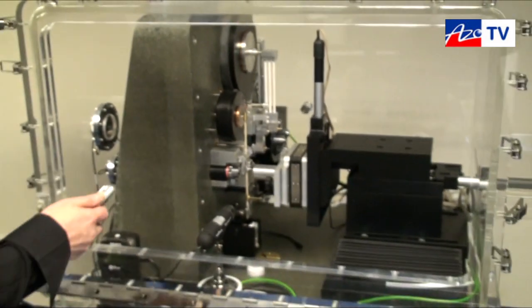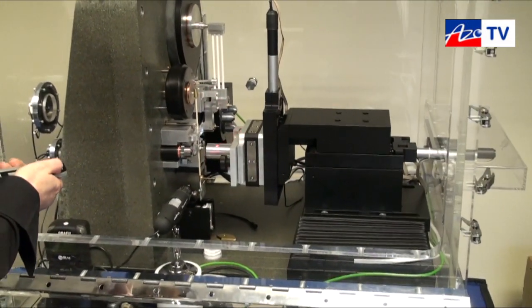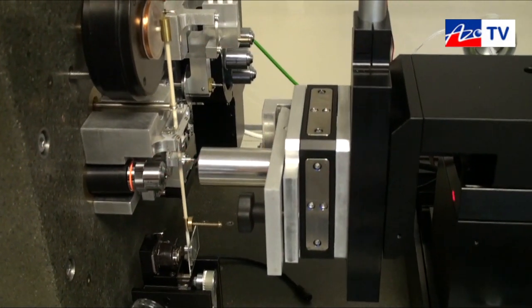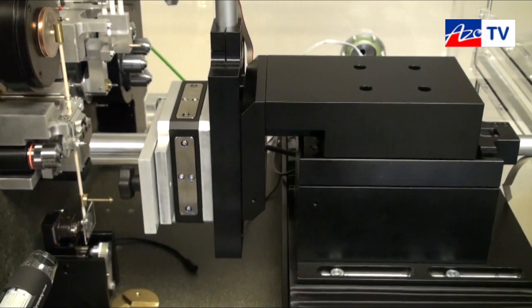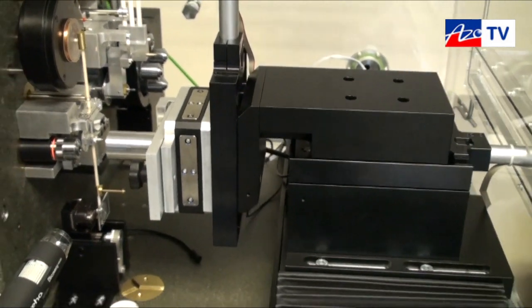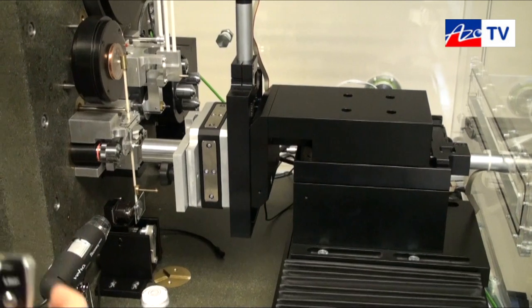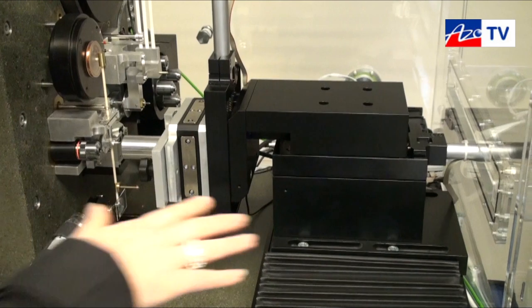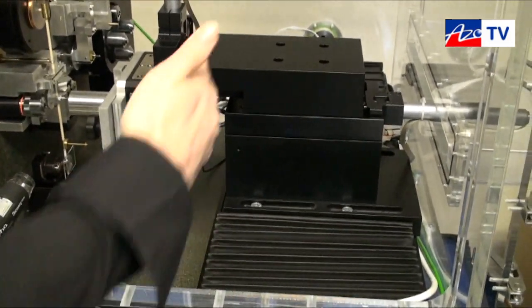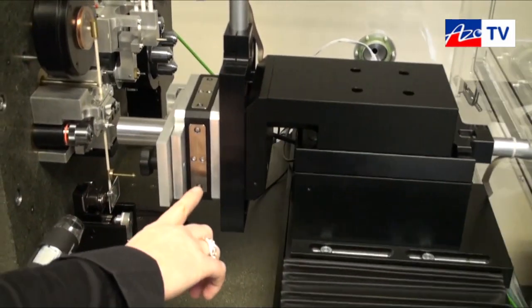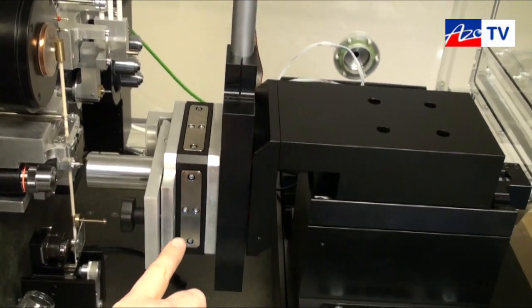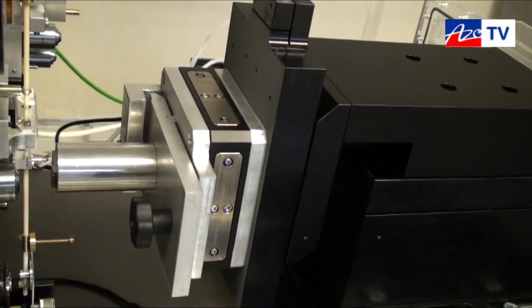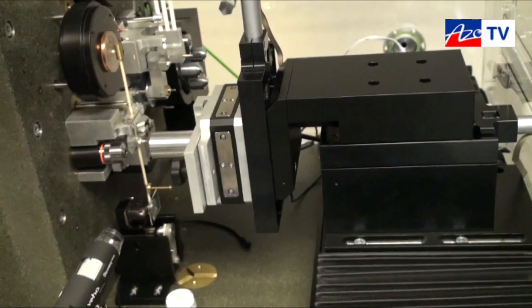So the sample, this is where the sample is mounted. So the samples are mounted at the front of the sample stub. And it's all mounted on a transfer stage. So the sample does all the movement. All the measurement stations are permanently fixed and the sample moves between the measurement stations automatically as controlled by the software. So this is coarse positioning in Y and then we have a nano positioning stage which allows repositioning of the sample with an accuracy of 3 nanometers. So that's very, very good for very fine structures.